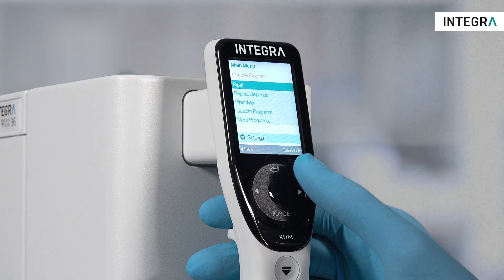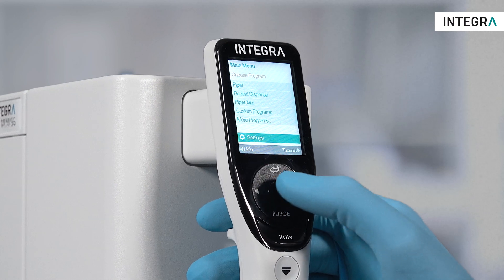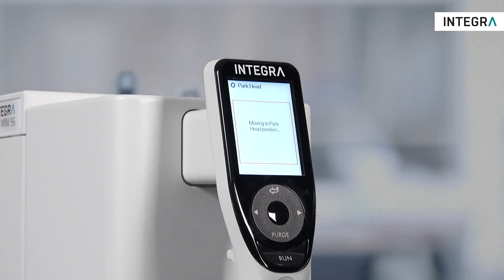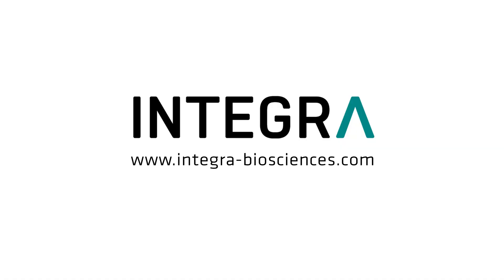To ship the MINI 96 for service or calibration, park the instrument in the settings menu and turn the instrument off. Now it's ready for shipping. Contact Integra if you have any other questions not covered in this video.